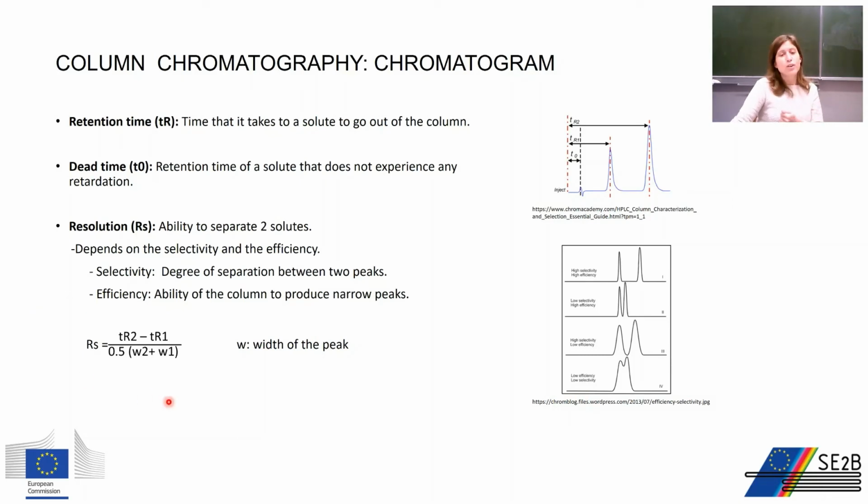And finally here we have the formula for the resolution, which is nothing more than the difference between the retention times of the two compounds divided by one half of the sum of the widths of the peaks of the two compounds.